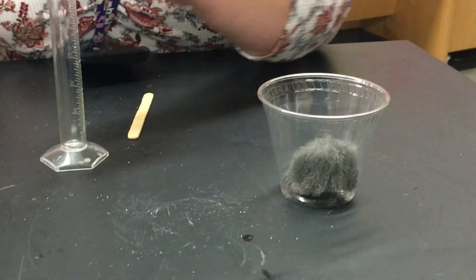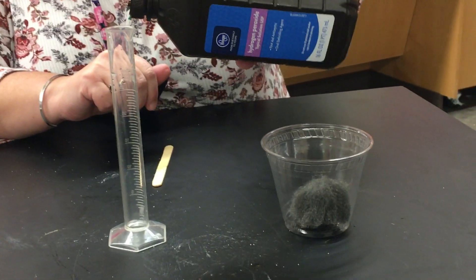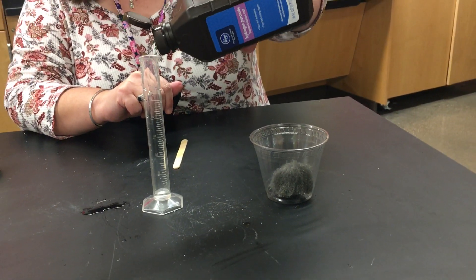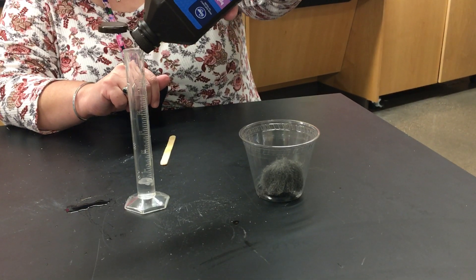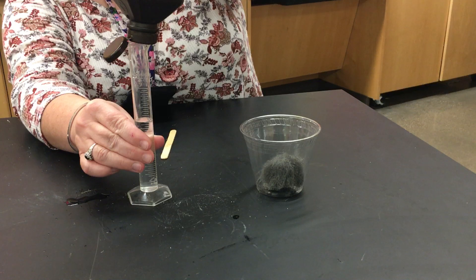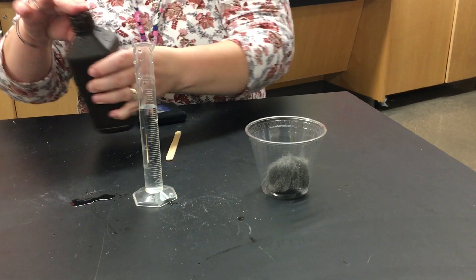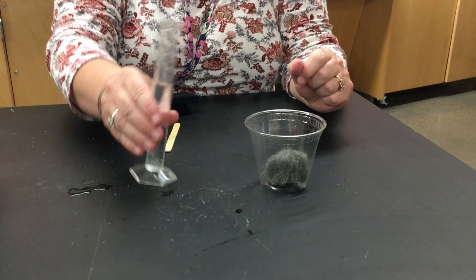I'm going to put it in the cup. Next, I'm going to pour 20 milliliters of hydrogen peroxide. There we go. I'm going to pour this into the cup.